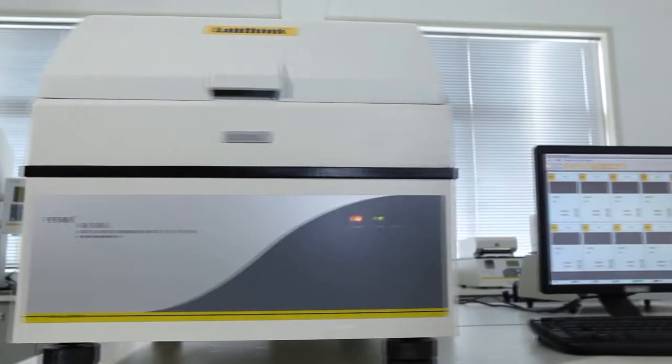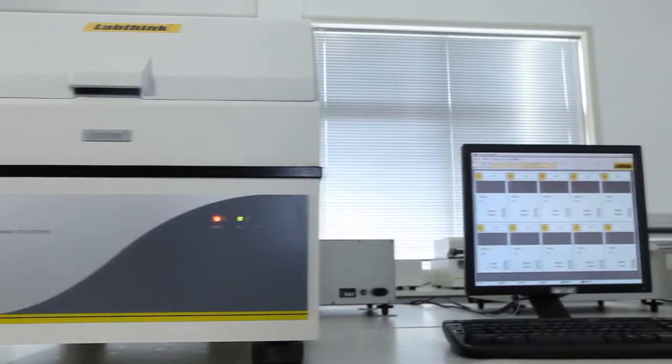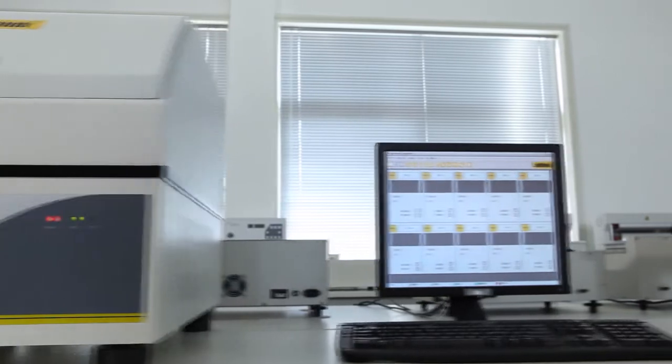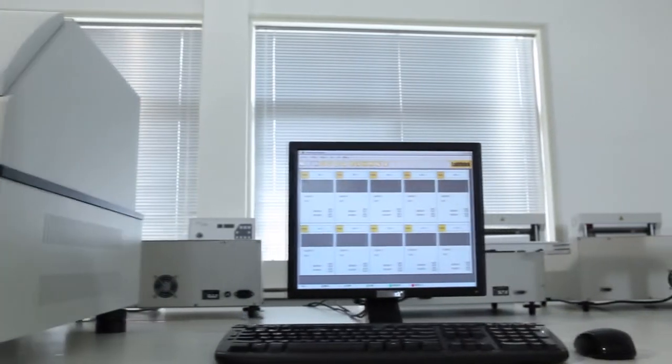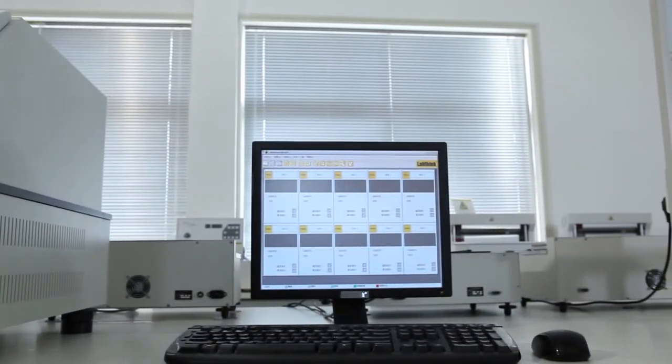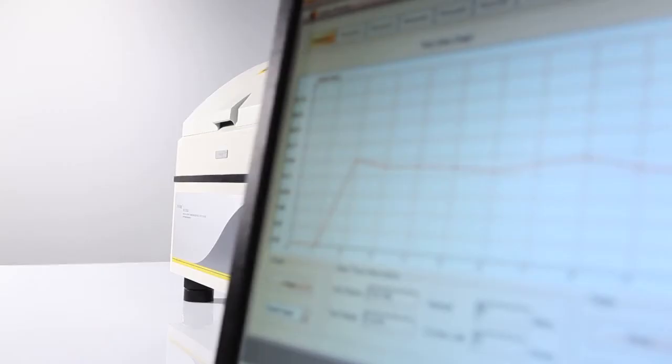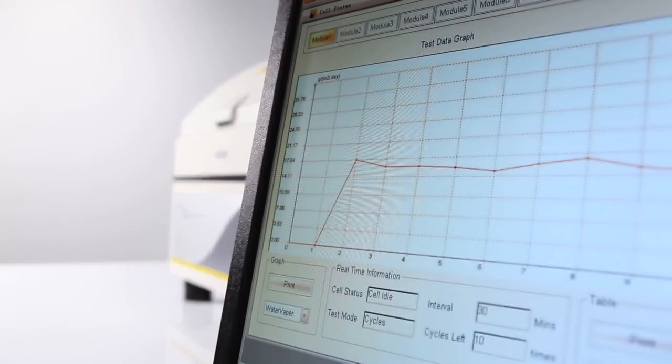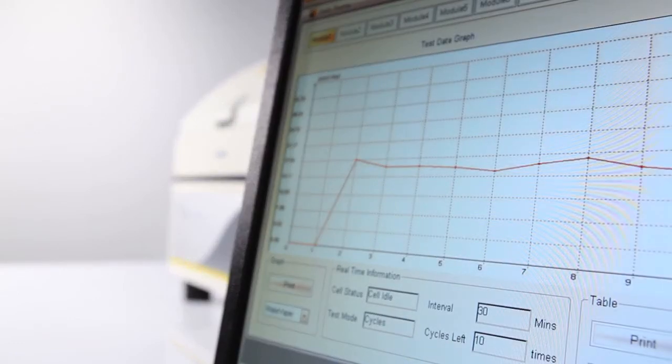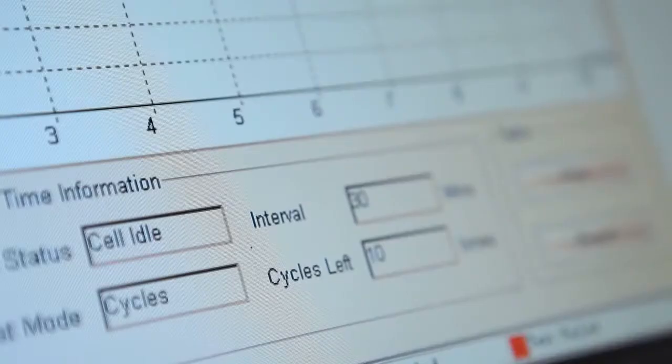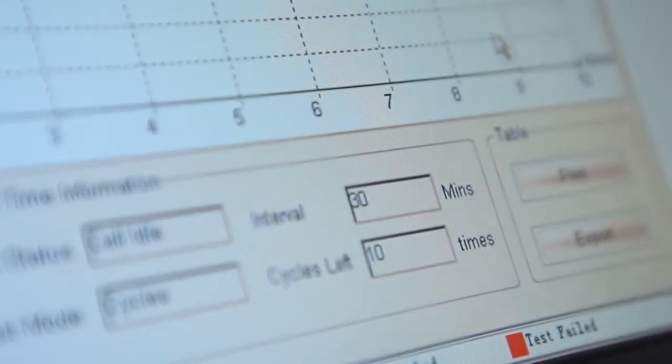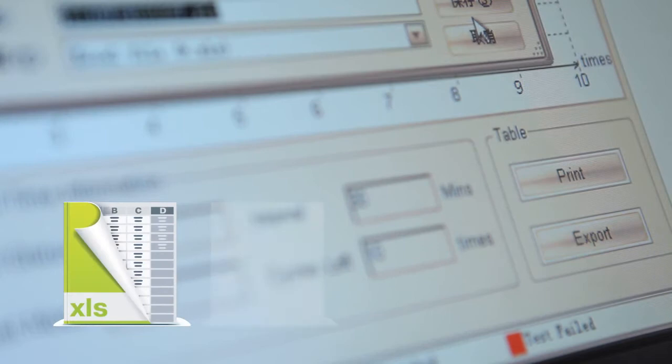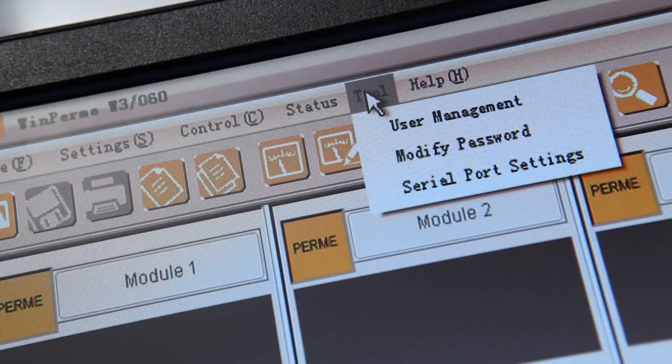The testing software designed by LabThink has a user-friendly operation interface and visual display of real-time graphs and data that can be saved in Excel format and database format.